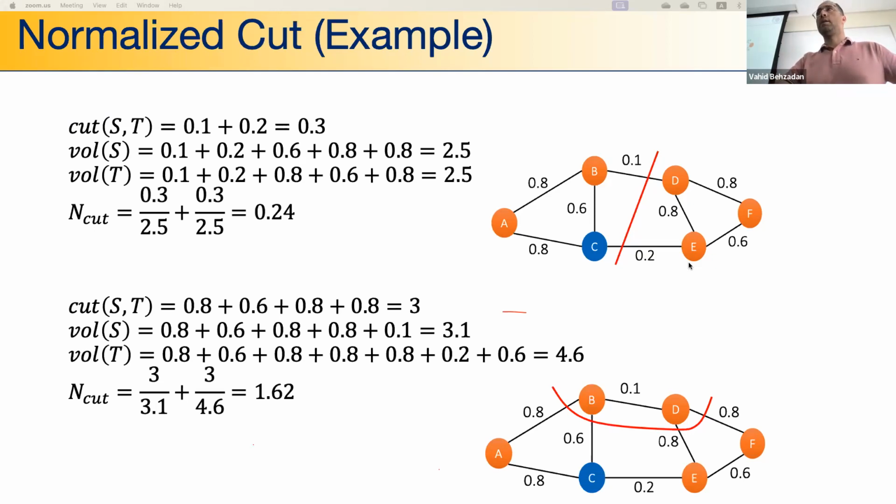So again, we have a mixed set of cells, right? When we perform an experiment, we get tissue samples and we separate the cells, but we don't know their identities yet. And then we cluster them in order to separate each group of cells, right? It's rare to just get one cell from a specific cell type.